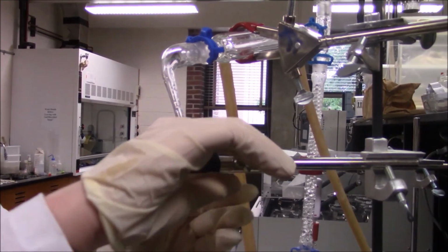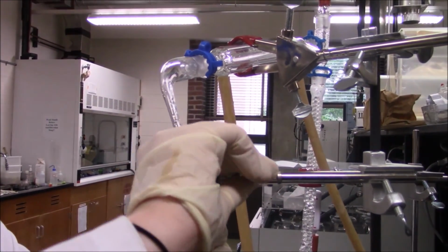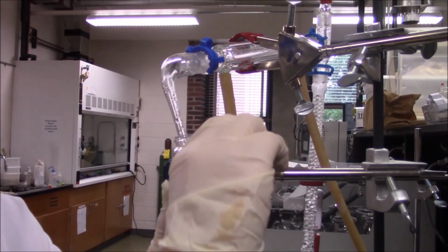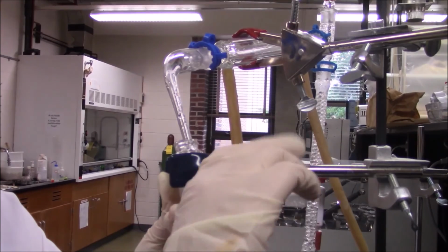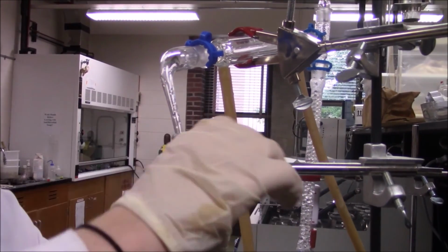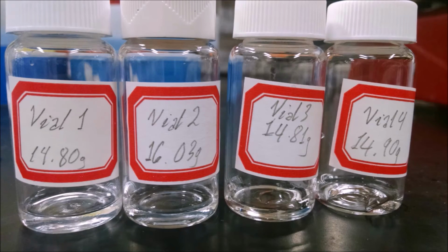The ethanol produced in distillation should be collected in the 4 20 milliliter vials set up at the beginning of the experiment. Each of these vials should be allowed to fill up approximately 1/4 of the way, then removed, capped, set aside, and replaced. Make sure that the same caps remain with the same vials. This ensures that the mass of each vial itself, without the ethanol solution, is the same at the end of the experiment.